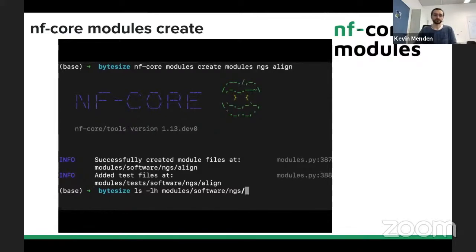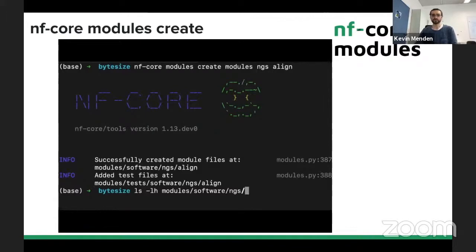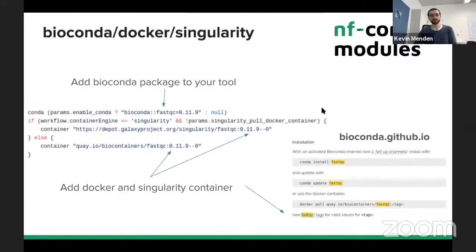An important step when adding a module is where you actually get your software from. These modules can run with three different tools: Bioconda, and the container technologies Singularity and Docker. The best way is to first get your Bioconda version of your tool. Here we have the FastQC module - you go to the Bioconda page, find your module, and you'll see a link to the FastQC tags with a list of versions. Once you have a Bioconda version, you can look for Singularity and Docker containers on Biocontainers and on the Galaxy Project Singularity page.